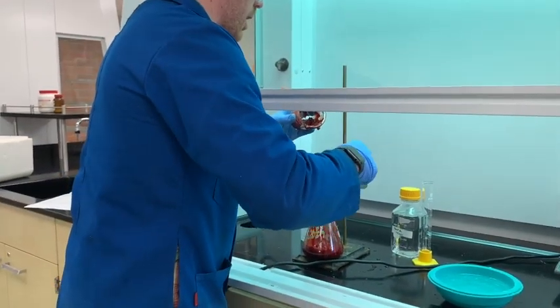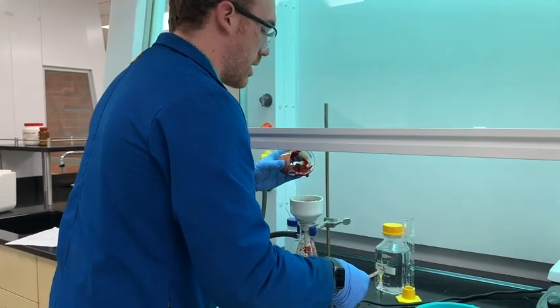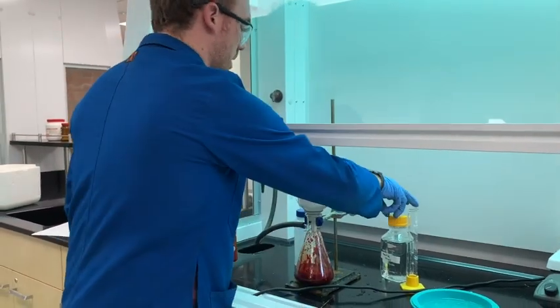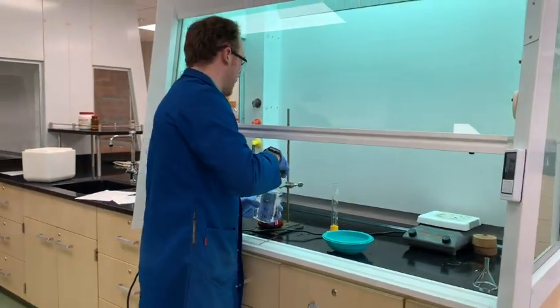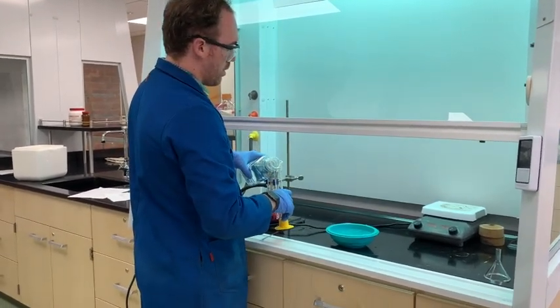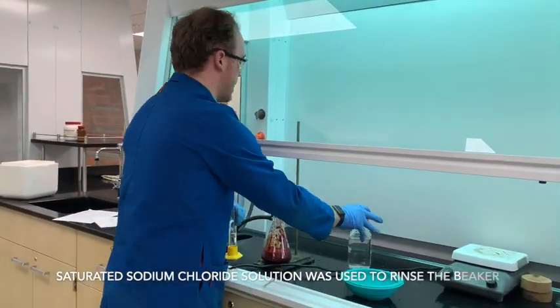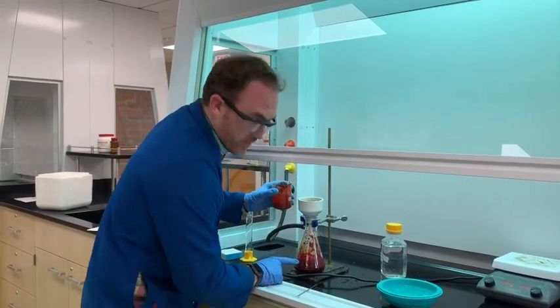So if you're going to wash this product, and by that I mean rinse the stuff that you just placed into the top of this filter, which can take a little while, you're going to want to make sure that you use a solvent that is not going to dissolve it well. So I'm going to take about 20 milliliters of saturated sodium chloride solution. That's coming pretty well right there. And I'm going to eyeball, that's about 20 milliliters. Look at that, that is just something else.